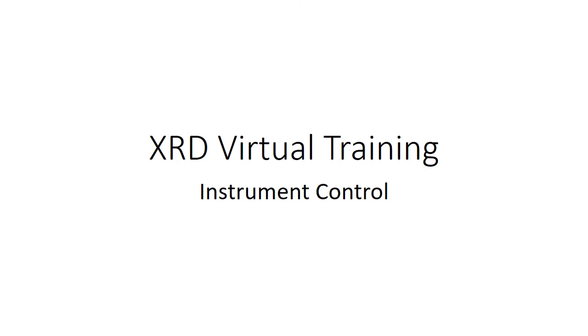Welcome to the next segment of X-ray virtual training. We're going to start talking about some of the software and the instrument itself.